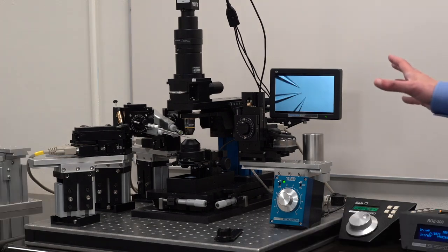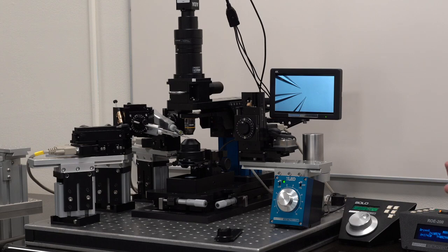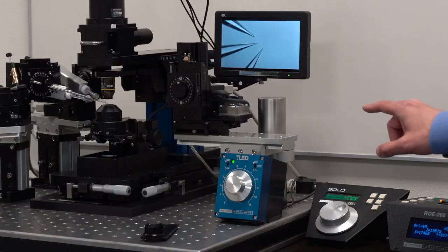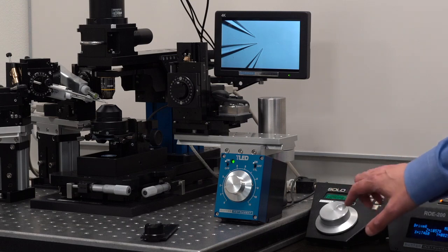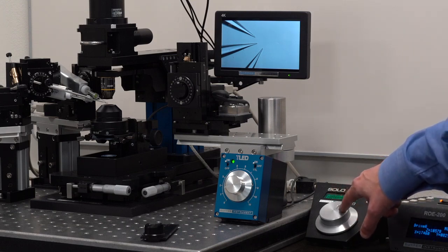In this setup is my favorite setup because as you can see, it's very, very busy and nice and full of potential. In this setup, I am using the solo to control my Z focus.